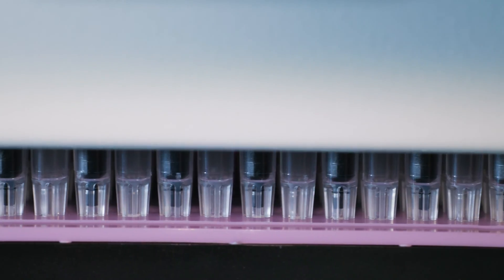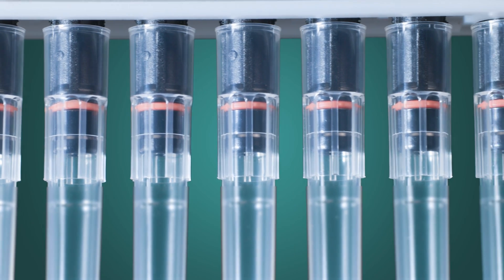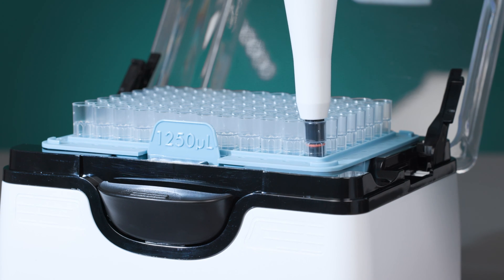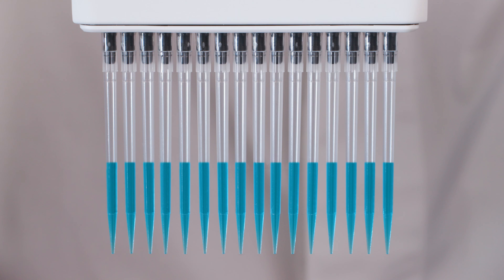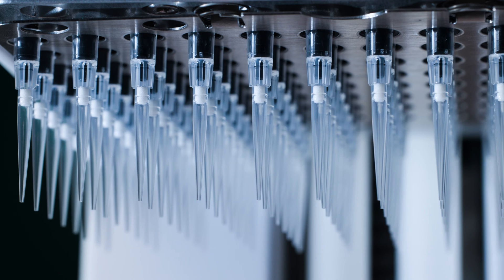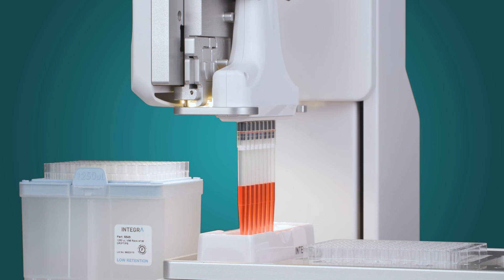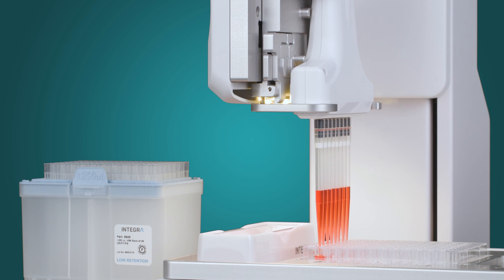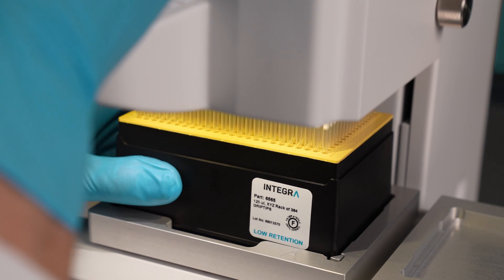Grip tips perform exactly as the name states. They snap on gently and the tips stay in place, ensuring that tips never loosen, leak, or fall off. The user experiences the touch and sound feedback that the tips have registered with the pipette. Once the grip tips have registered, the tips have reached their defined Z-height, meaning all your tips are aligned perfectly. This avoids pipetting air and wasting reagents in your wells, and also ensures a consistent touch-off of all tips, which is especially critical when using a ViaFlow 384 pipetting head.